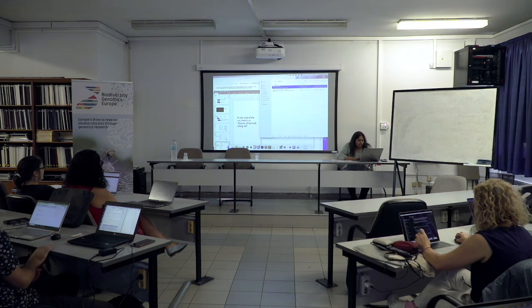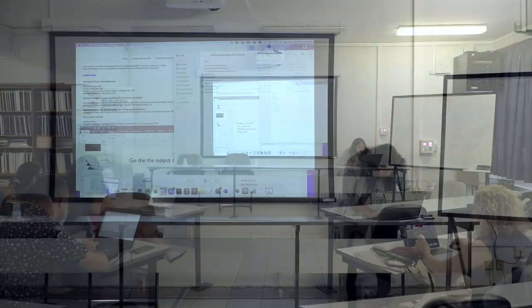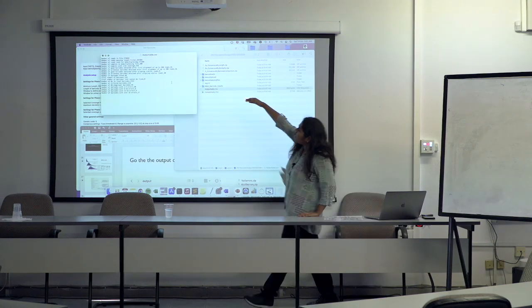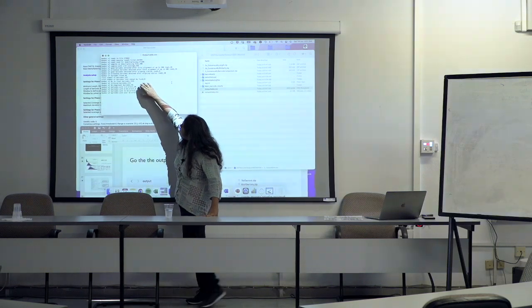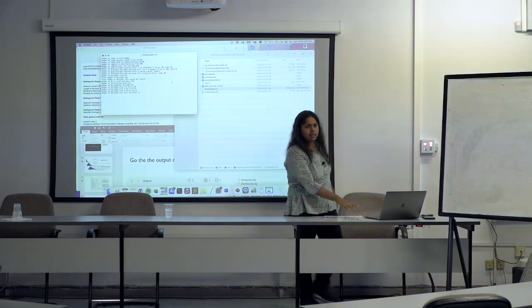I think I can get to the files. Am I looking at the right files? Is this more like the run that we have, which is the number of reads? So what's happening in this is basically 111 filtered barcodes, at least on the Mac that I ran.